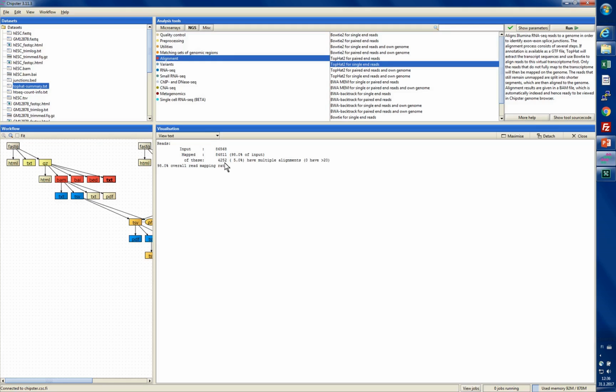So I just wanted you to make a mental note for yourself here that definitely in the result file you will have more alignments than you had reads to start with, because some reads will have been aligned to many places. None of them were aligned to more than 20 places, but they were aligned to several.